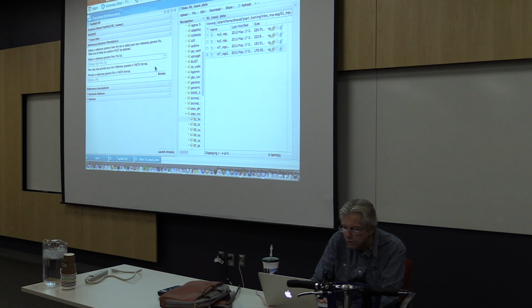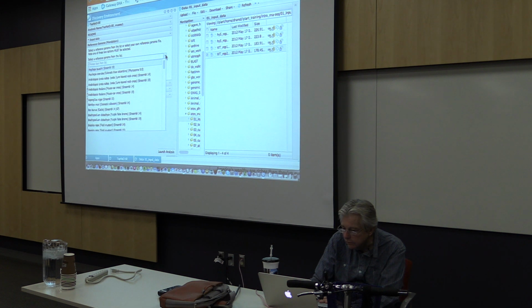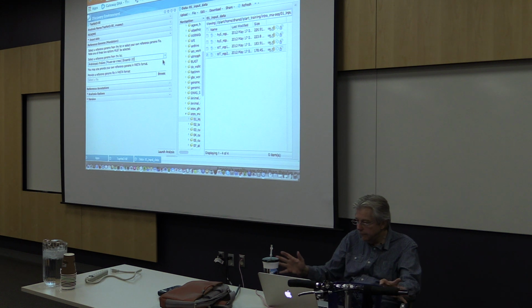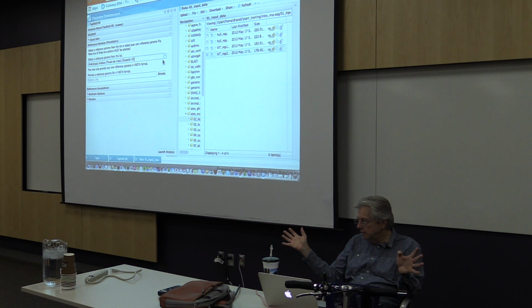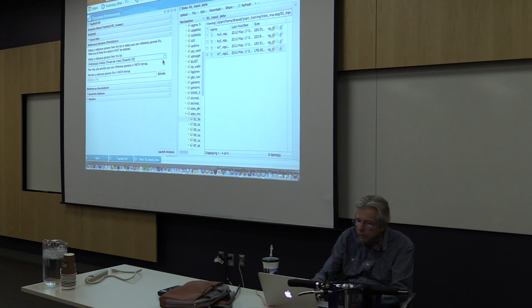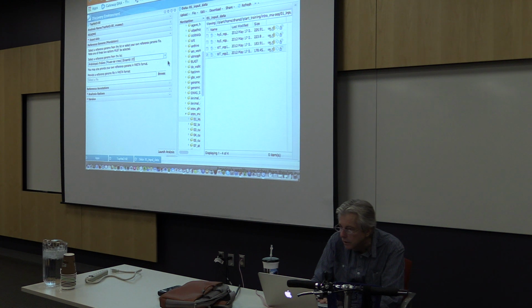Your reference genome. Here again, we're working with Arabidopsis. That's already listed under our reference genome list. You can use the latest Ensembl information. But if we had something that wasn't in the iPlant data store, you could upload your own reference genome sequence, and you can put it in there.